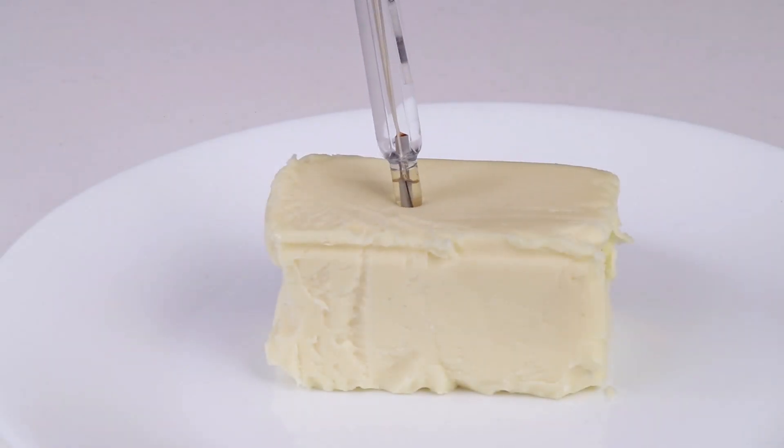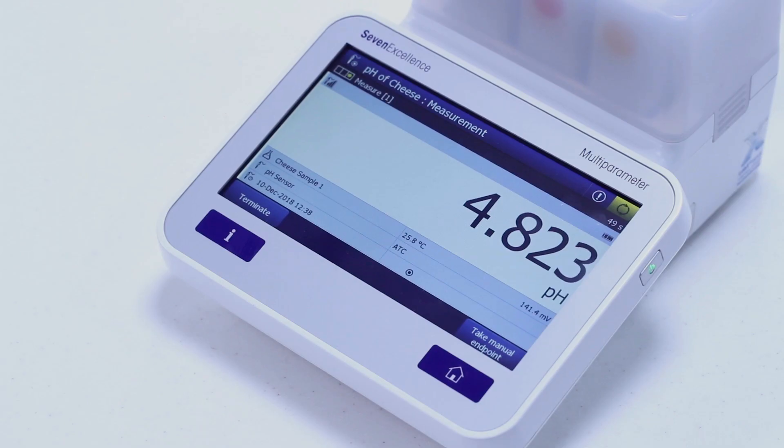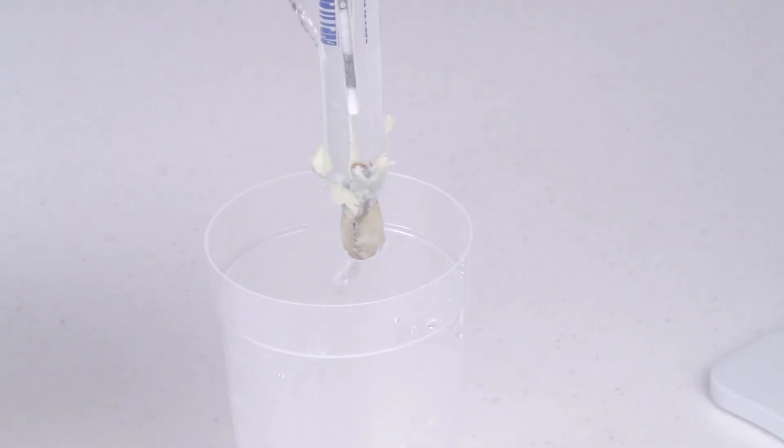It is difficult to pierce the pH electrode with a spherical shape into solid cheese samples for measurement. High fat content results in insufficient miscibility of the outflowing aqueous reference electrolyte with the sample, which results in high response time. After the pH measurement, it is difficult to clean the sticky residue of cheese sample from the pH electrode junction and glass membrane.